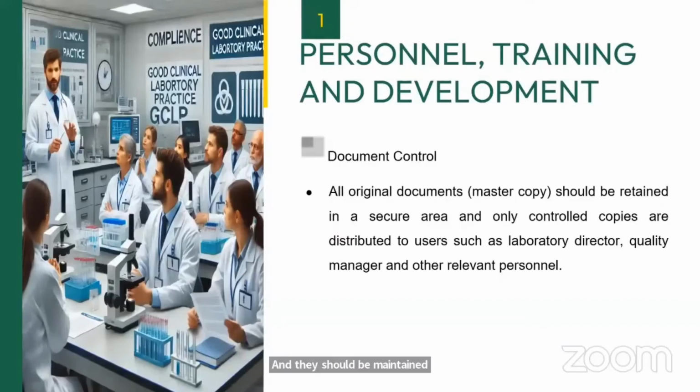Now, what is meant by document control? Basically, you need to identify each and every document. You need to number it or give a specific identification, a specific title to each document. You have to control them. You have to see who has prepared them, when they were revised, who has revised. If any changes have been made in those documents, who made those changes, what was the date, what additional inclusions were made, what deletions were made, when it was made, what is the version, what is the current edition of those documents, and how they are controlled or how they are distributed.